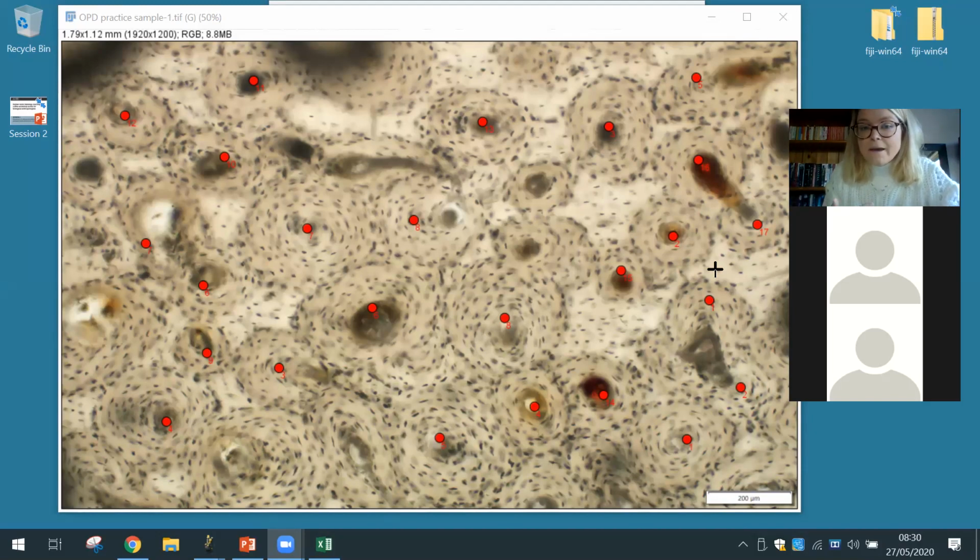So when someone's peer reviewing your paper and you only report fragmentary osteons, you need to have a really good reason for that. You may say, I'm really only interested in the fragmented osteons, but you should typically report the OPD. If you look at most of the publications like I've done, I would actually report everything. So I'll have intact, and then the fragmentary, and then the OPD value. That way we're transparently reporting everything, basically.